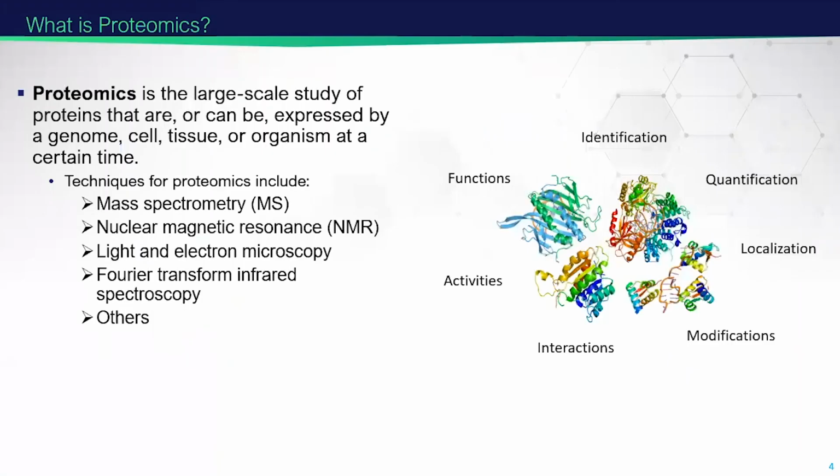So before we go into mass spectrometry-based proteomics, we also want to understand what proteomics is. Proteomics is basically a concept. It's a protein equivalent of a genome, which appeared around 1994. While work with proteins, especially individual proteins, began much earlier, like the 50s or 70s, mainly by electrophoresis.